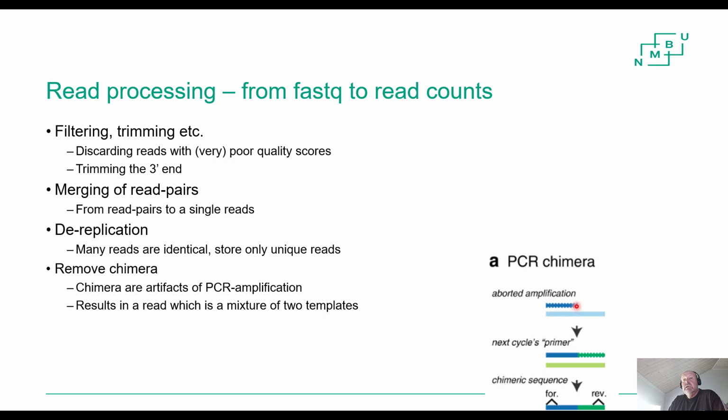because it's a shorter piece, right, that floats around together with the primers. And now imagine there is another bacteria, a green one, which is different from the blue, but they are identical up to here, right? So they differ only in the next part now. And then this blue fragment from the first copying will bind here, because it's similar enough. It doesn't have to be identical even, it's similar enough to bind, and it acts like a primer, and then we start building the rest here.